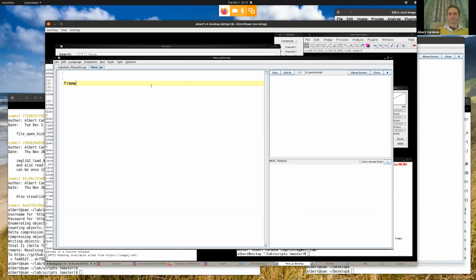So first of all, I'm going to need a frame. Actually, I'm going to need a table. And because I'm going to need a table, I'm going to need a way to express data in that table. And this is done with a table model. The model here in the parlance is the actual data behind any one of these user interface components. So the table model, I'm going to make it extend an abstract table model because the interface would force me to implement every method, and it's too many. And so instead, I'm going to use this.